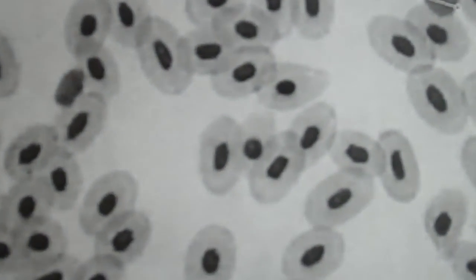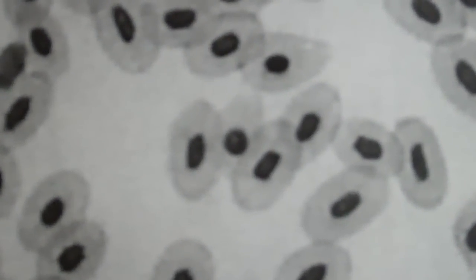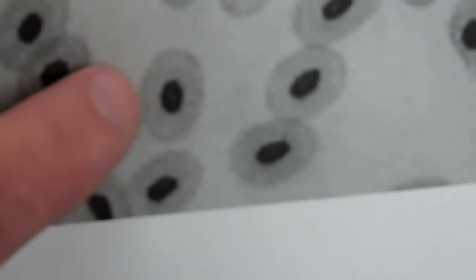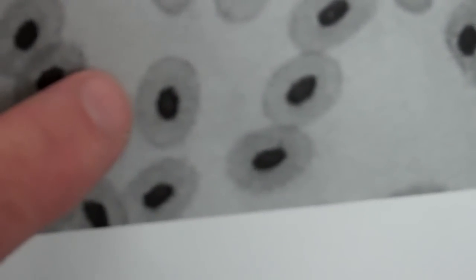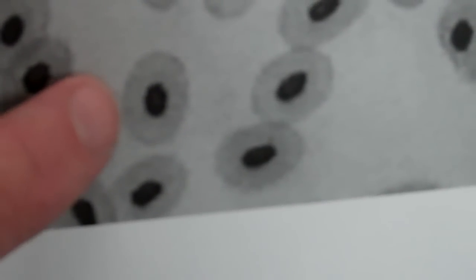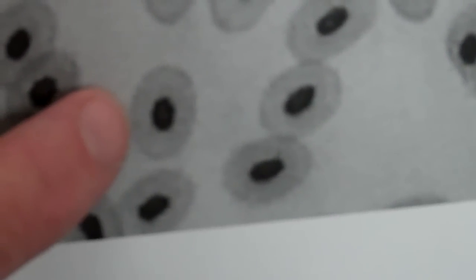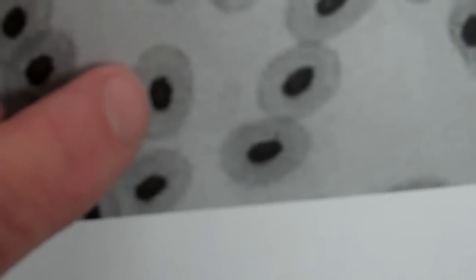Now, each one of those ovals is one cell. So this oval right here, this oval right here - that's one frog blood cell. The cell membrane is on the outside and the nucleus is on the inside.